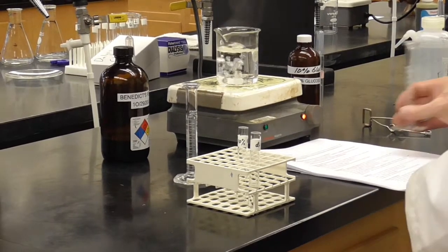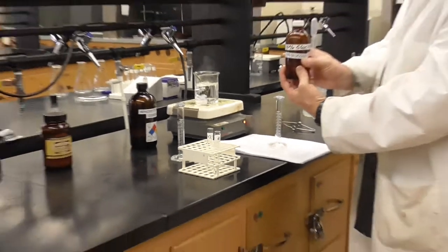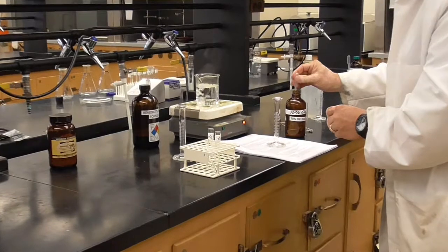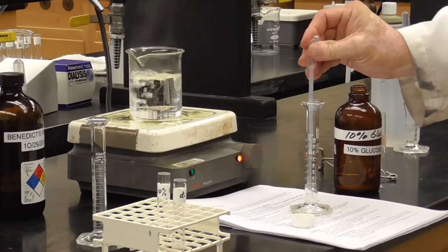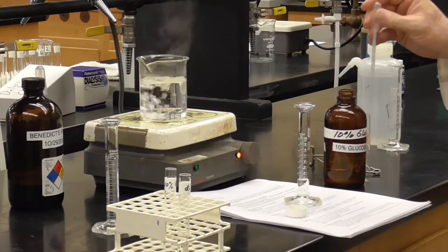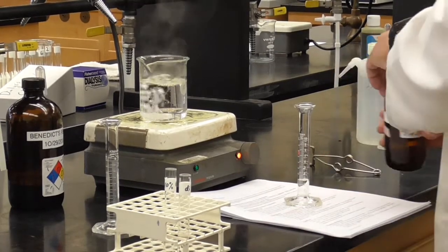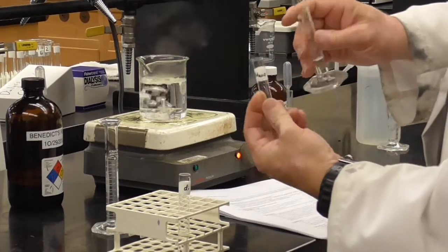And then for our positive, we'll use 10% glucose, prepared ahead of time. Remember, glucose is blood sugar. So you could use this kind of test to see if you have that present or not. Maybe you're looking for whether you have glucose present in urine or something like that. So here's 3 milliliters, and we'll pour that in our second test tube labeled glucose.